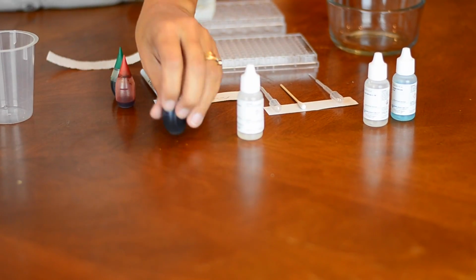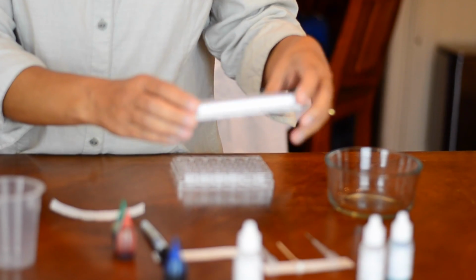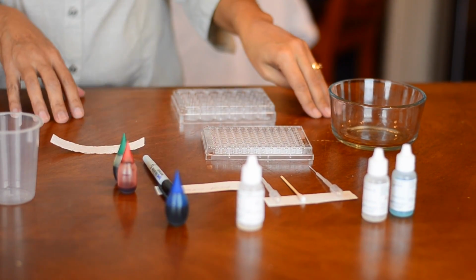While we're mentioning the solutions, I'll point out a couple of tools that you're going to use. The first is a 96 well plate. In your kit you would have received 2 plates. Make sure you use the 96 well because its little wells are small enough to mix the very small amounts that we're going to be using today.